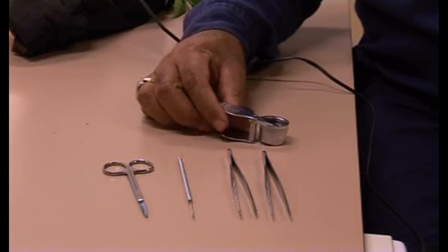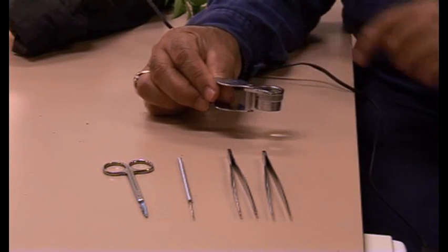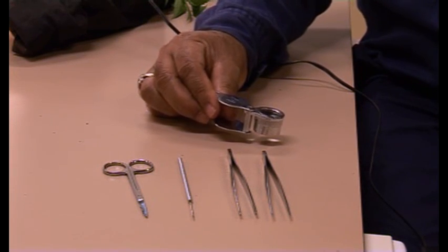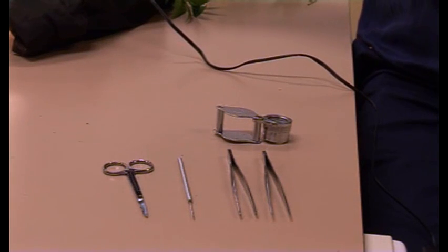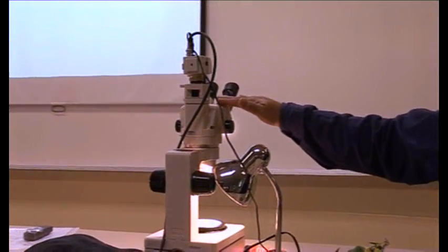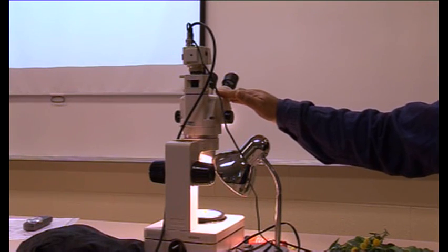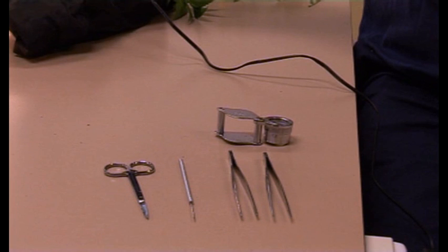A magnifying lens, something like this which can magnify objects up to ten times, should be enough to deal with many flowers. If not, when you come to the residential school, you can use the microscope to dissect tiny flowers. So you don't have to worry about the microscope — these tools should be more than enough to get the basic information needed for plant identification.